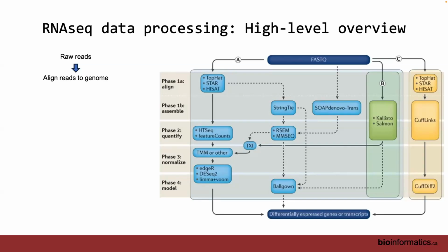For methylation data, the methylation assays sometimes use techniques that convert the bases, right? They convert some C's to T's, and they leave other C's as is. So the aligner has to be methylation aware. You can't just toss it into a regular aligner. It won't align well.